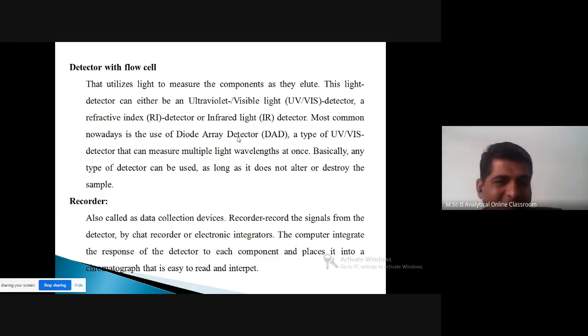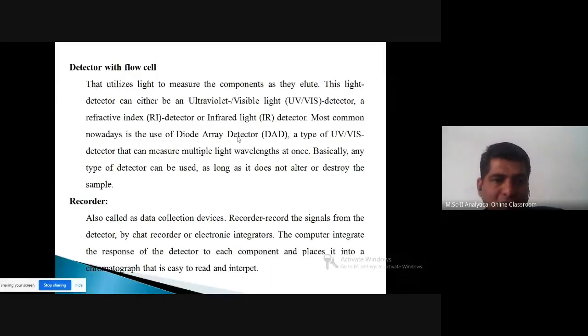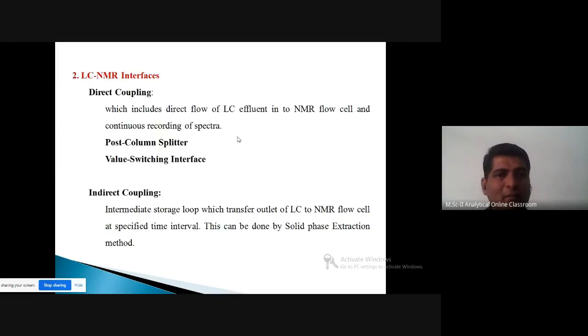And the last part is a simple recorder, which will record all your sample and give the spectra, from which you can get an idea about the mixture. Okay, so this is another simple image of the HPLC system. Now the next part is very important as a hyphenated technique.